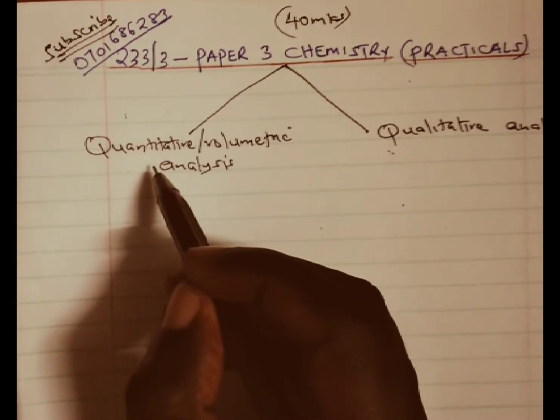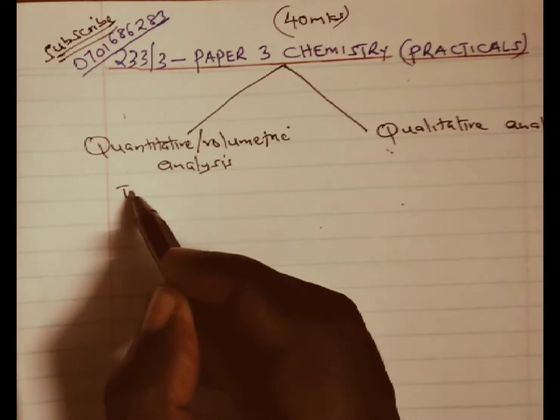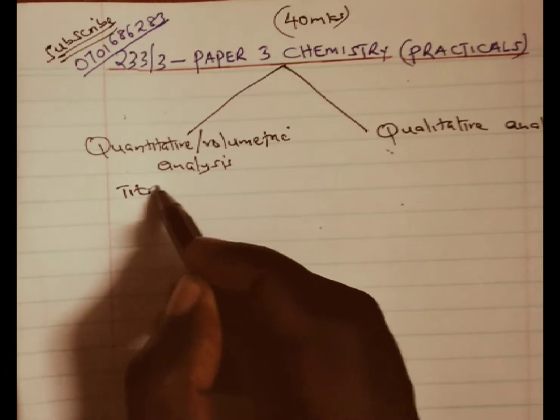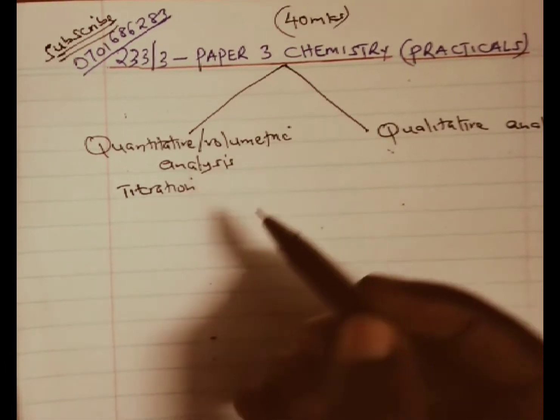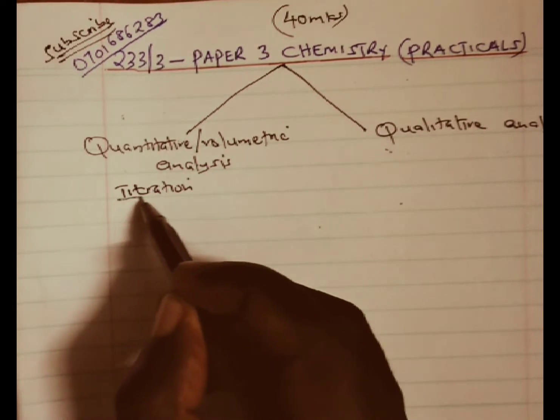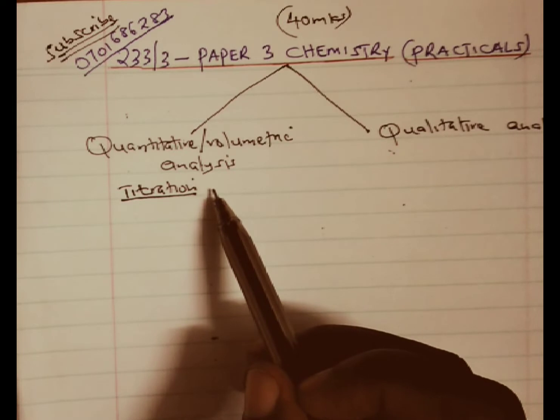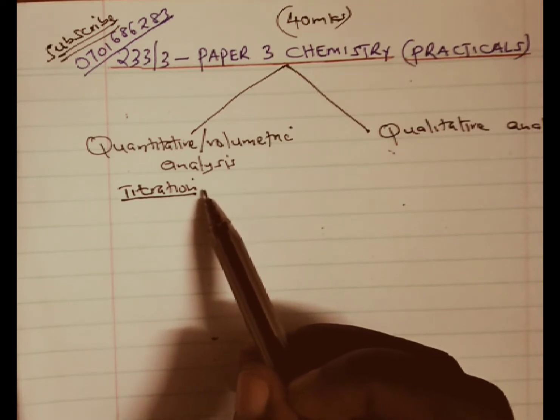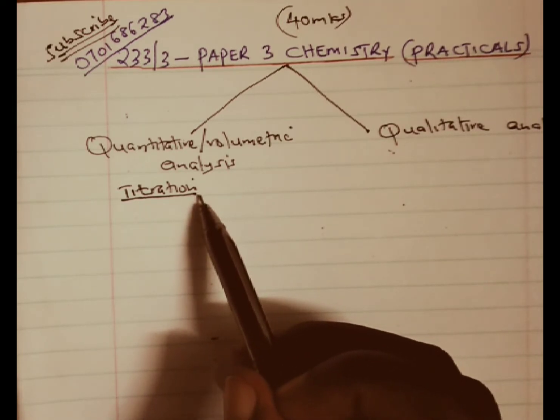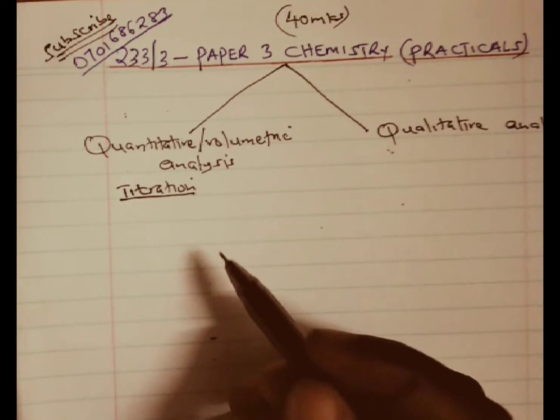Under quantitative or volumetric analysis, we mainly deal with titration experiments. And remember, titration is the process of running a solution from the burette to a solution in the conical flask until you observe the color change.